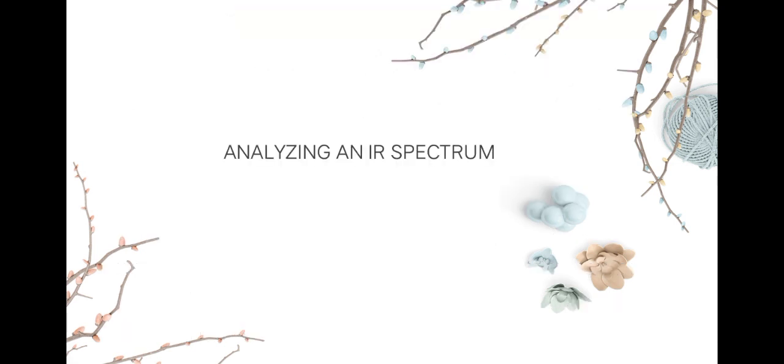When analyzing an IR spectrum, the first step is to draw a line and focus on any signals to the left of this line, the diagnostic region. Now, what is the purpose of analyzing an IR spectrum? The reason is that it is used by chemists to determine the functional groups in molecules. IR spectroscopy measures the vibrations of atoms, and based on this it is possible to determine the functional groups.